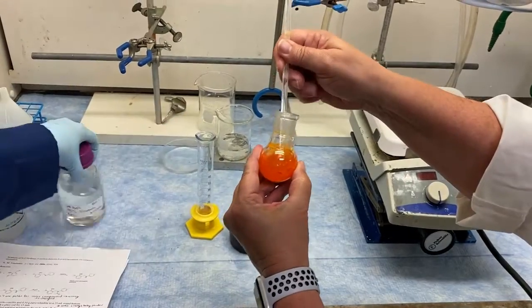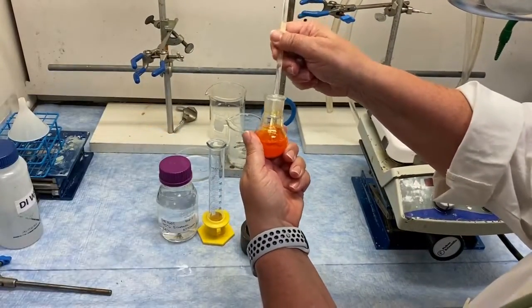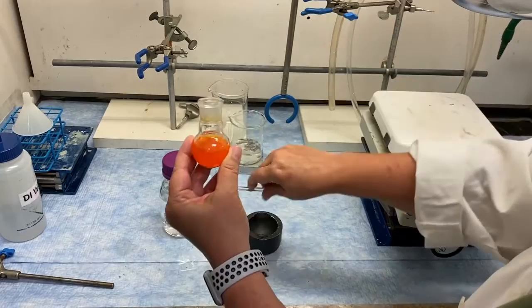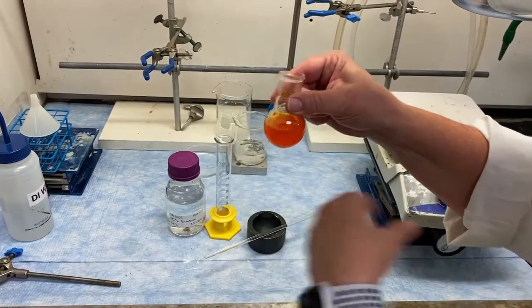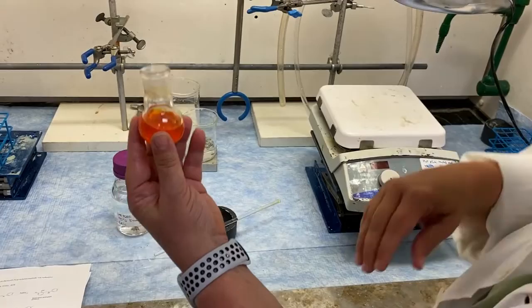So we finished forming the imine. We added our 15 mL of ethanol. The imine didn't dissolve because it's pretty nonpolar. But now we're going to do the actual reductive amination portion. So I'm going to set this up over here and stir it. And then we're going to do the reduction with sodium borohydride.